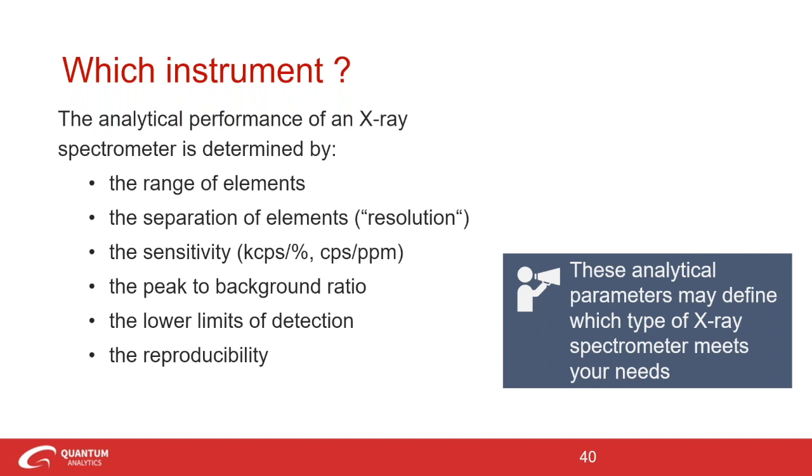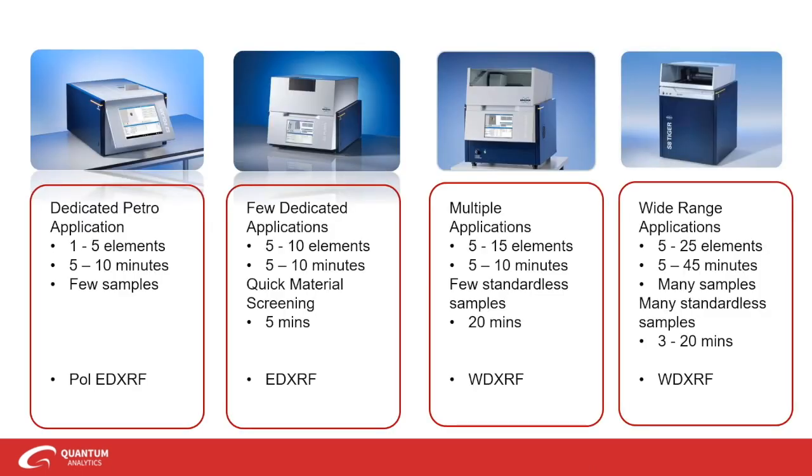Again, when you think about this, it really makes it sound like, well, geez, maybe WD is the way I need to go, right? Because it can do all these things. However, that's not necessarily the case. These are all parameters and things that you need to consider based on the type of analysis that you want to run.